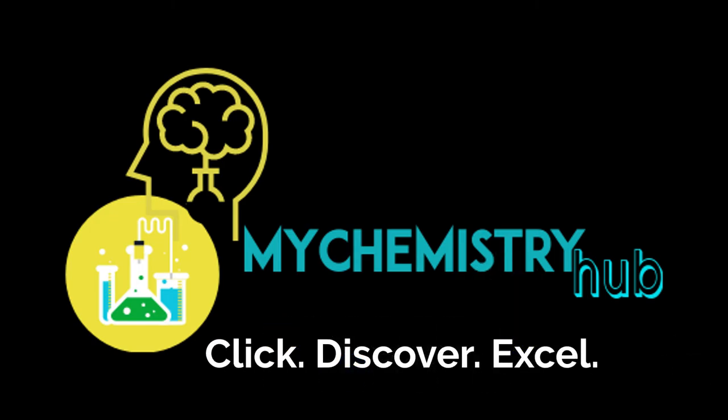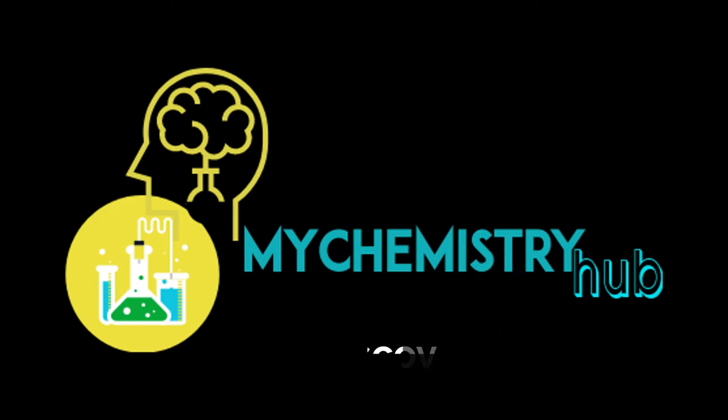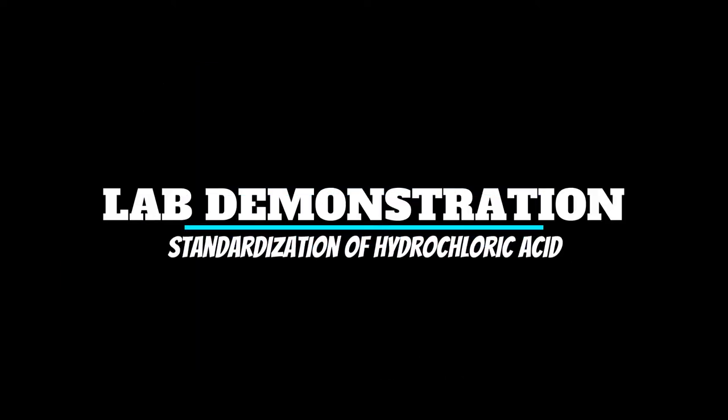Hi everyone, Sherian here and welcome to My Chemistry Hub lab demonstration. Today we will be standardizing HCl using sodium carbonate.